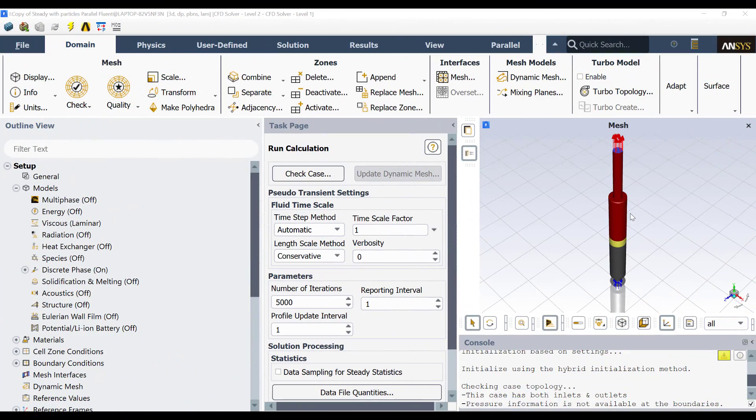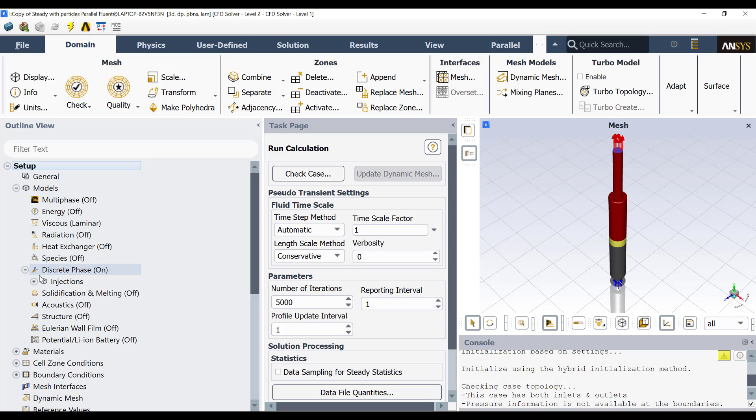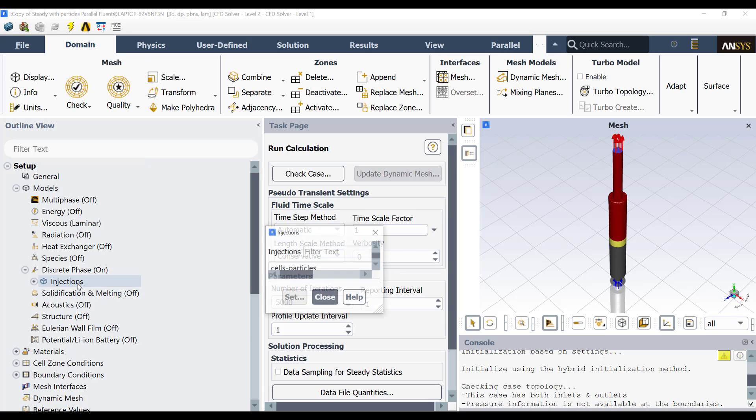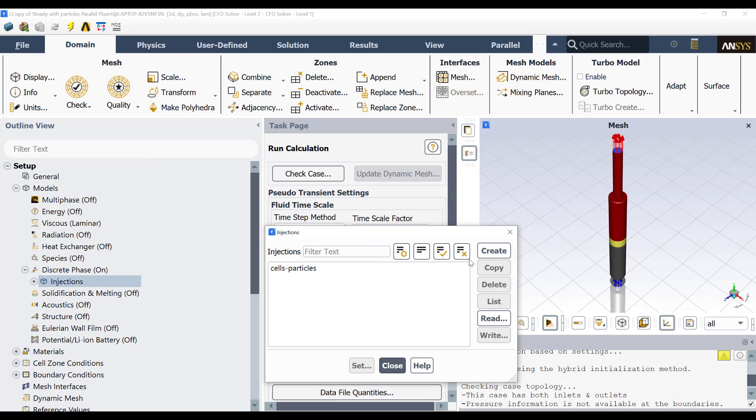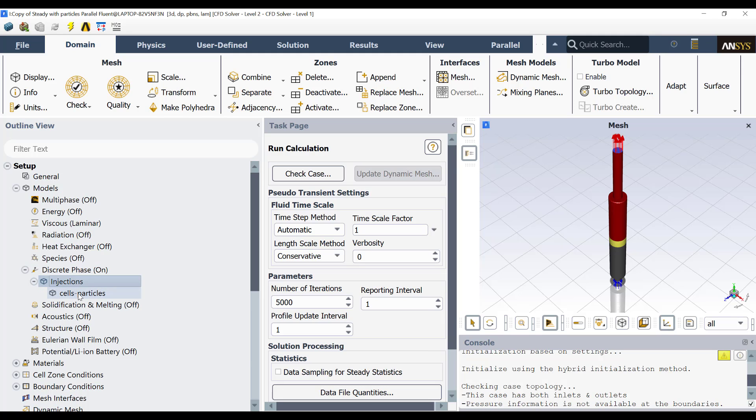Once you have solved the fluid flow field, as we saw previously in this video, we can inject the particles. Then for injecting the particles, what we have to do is go here to discrete phase. In this case, we are going to solve the particles using a Lagrangian approach. Then you go here and you will create an injection. The injection is created by double-clicking here in Injection. Then you will click here in Create. I already created an injection. It is called cells particles.